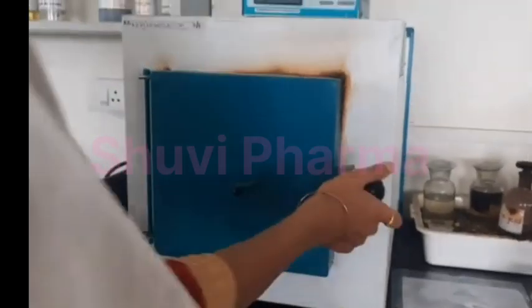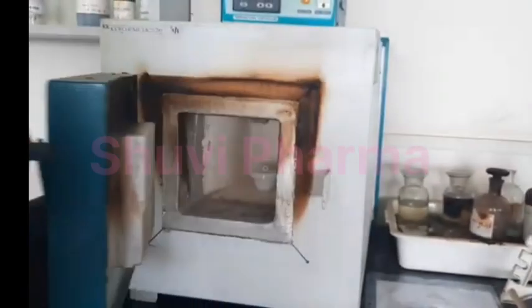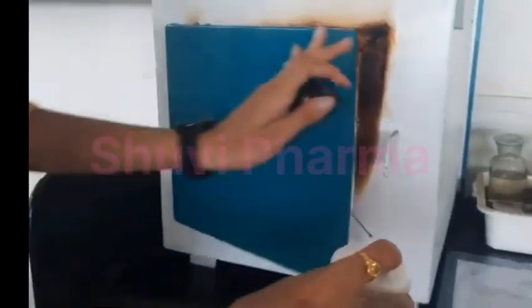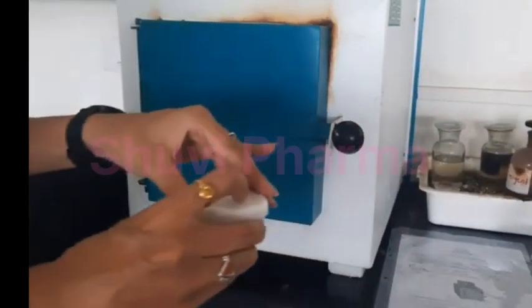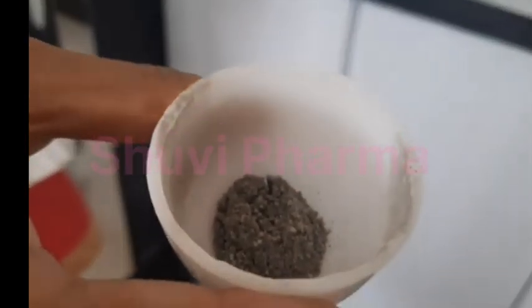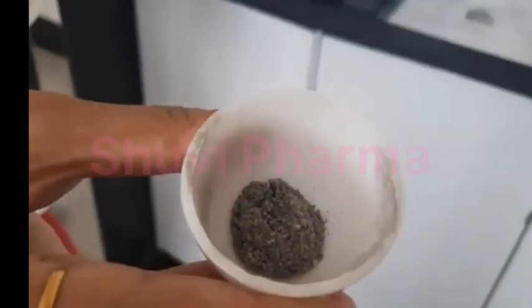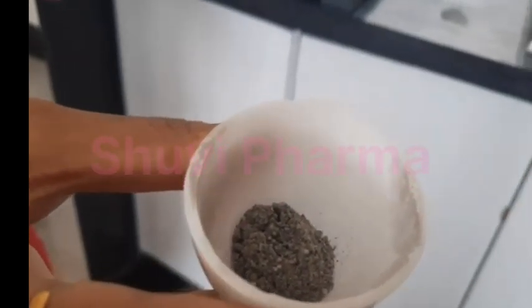After 6 hours, we will remove the crucible from the muffle furnace. Now we will calculate the weight of this ash. This is the total ash which is obtained after incineration. Now we will calculate the weight.